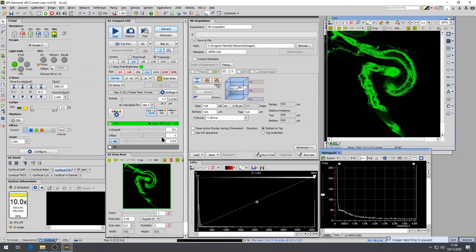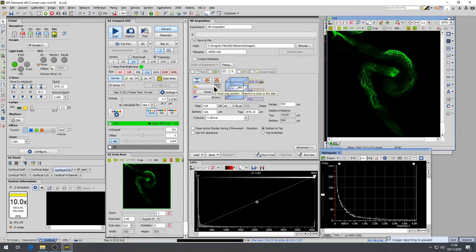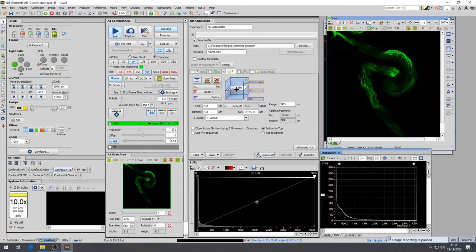Adjust the Z-Focus until the image is barely visible, and mark this position by selecting Top in the Z-Stack panel. If you are not sure which way you are going up or down, you can look at the LCD panel on the microscope as the Z-Position is displayed.